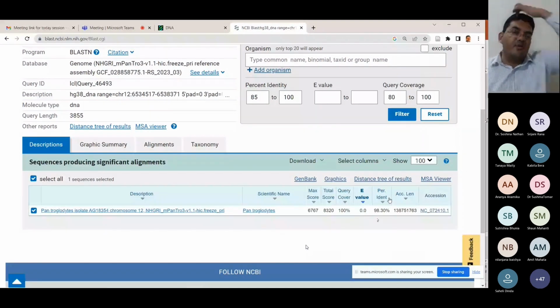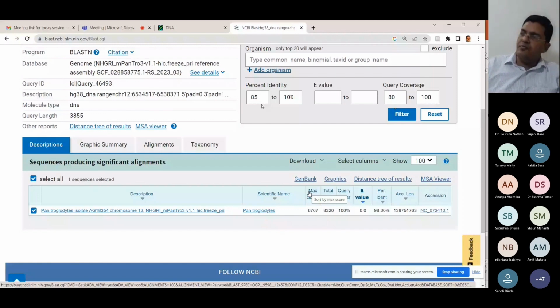So you could filter because you'll get a lot of nonsense. As you can see, there's a small thread that finds multiple matches elsewhere. You could have, let's say, a repeat sequence in your gene sequence also in an intron. That repeat sequence will go to multiple places in the genome and give you hits. So therefore, those filtrations are important. Two important filtrations are one with respect to e-value. The other is also with respect to query coverage, right?